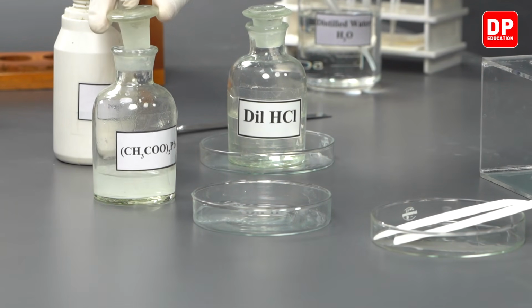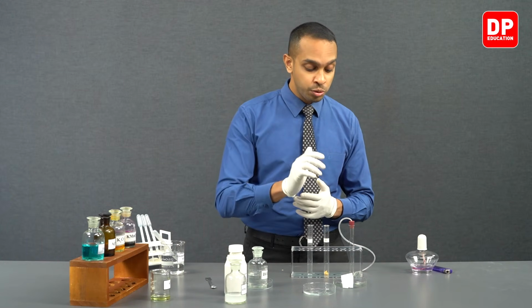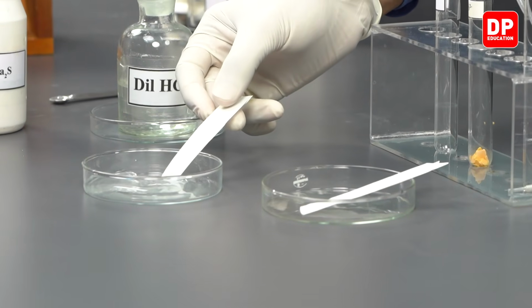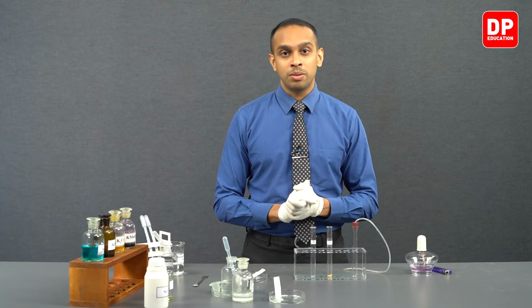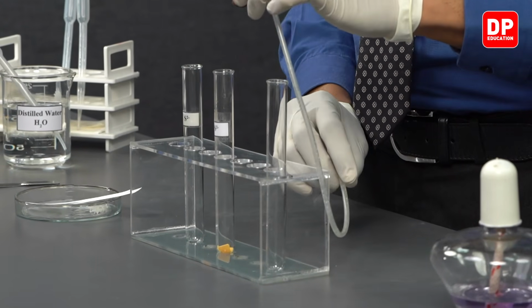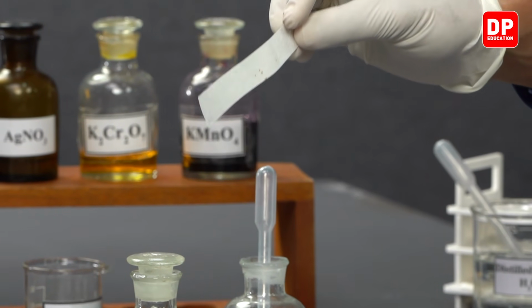After taking a small amount of lead acetate onto a petri dish, we can now move on to soaking a small piece of filter paper in lead acetate. Now, all that is left for us to do is add the HCl to our sodium sulfide that we have here. And as soon as we add it, we are going to place the stopper and direct all the hydrogen sulfide that is produced through this delivery tube onto our filter paper soaked with lead acetate.